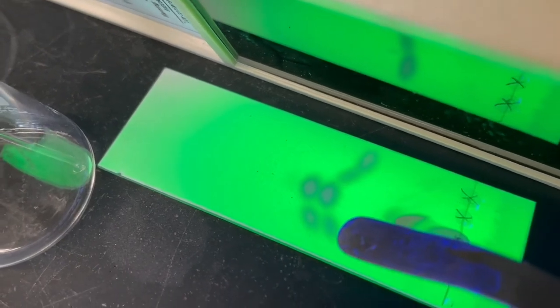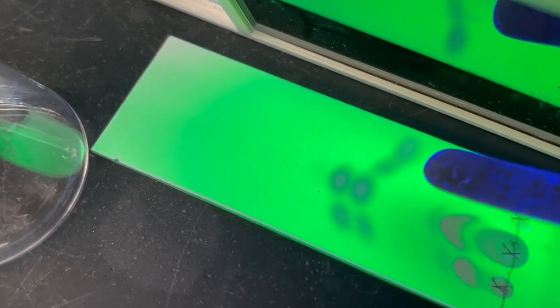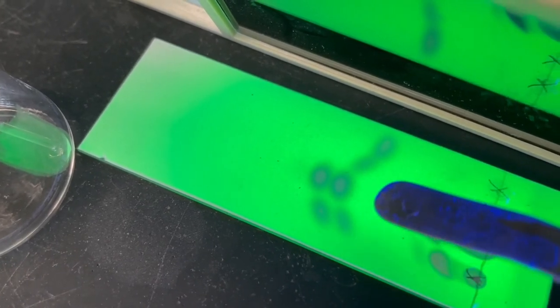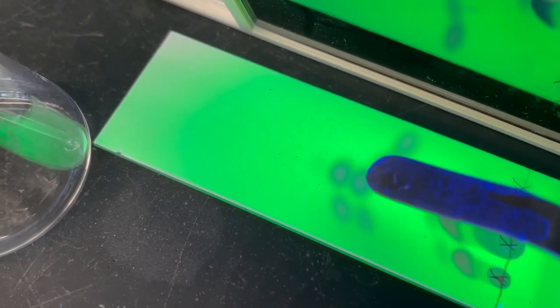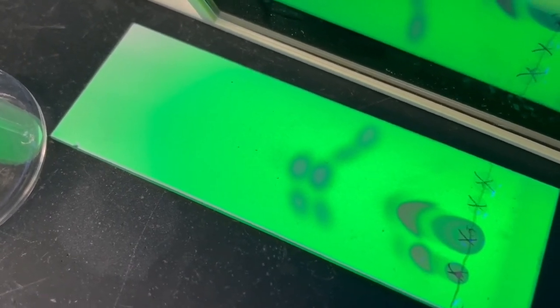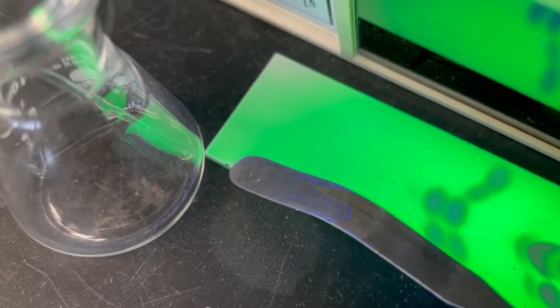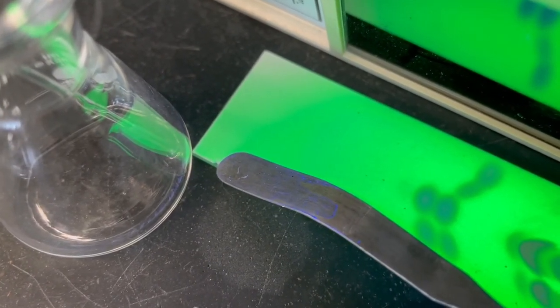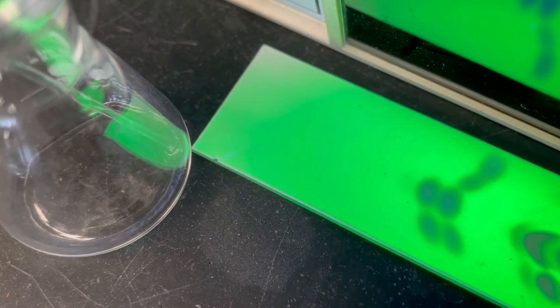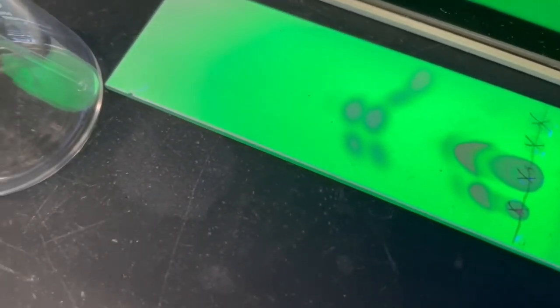Okay, and now these blue spots look cool, right? That is the trans product, and then the top one is the cis trans product. All the way up here, I made a line right there because I didn't have the pencil. I just scraped off some of that silica. That's the solvent front. That's how high the solvent went.